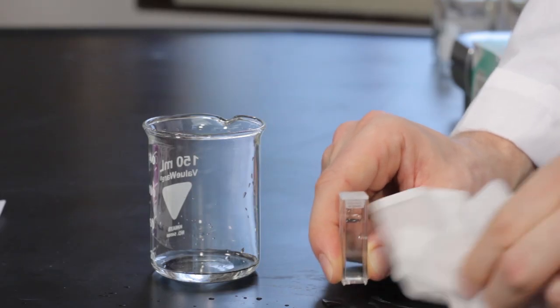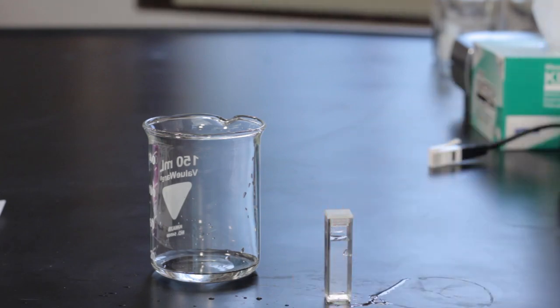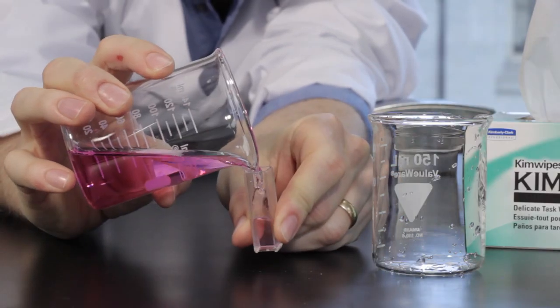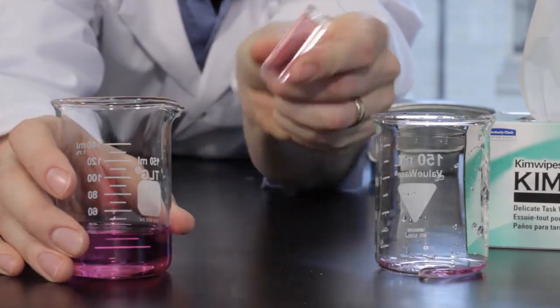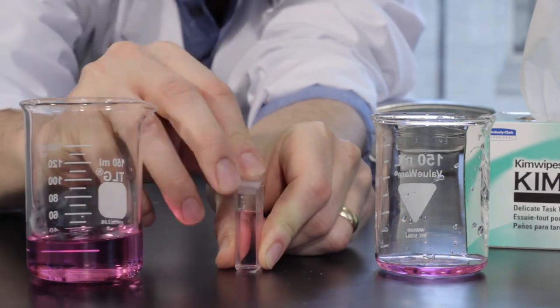Fill one of the cuvettes with distilled water and cap it. This will be the reference solution. Rinse the other cuvette with solution 5, 2 times. Discard the rinsates and fill the rinsed cuvette with the solution. Then cap it.